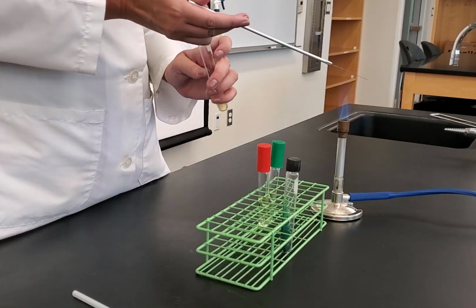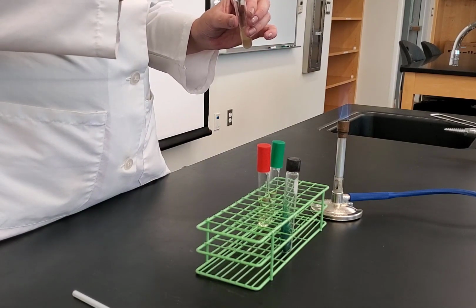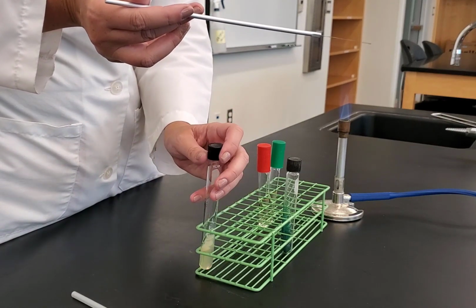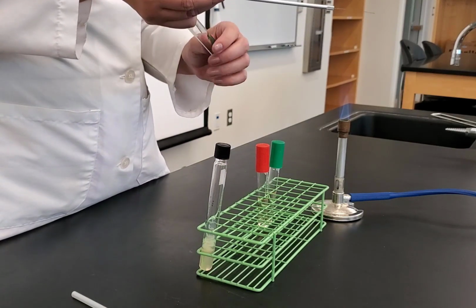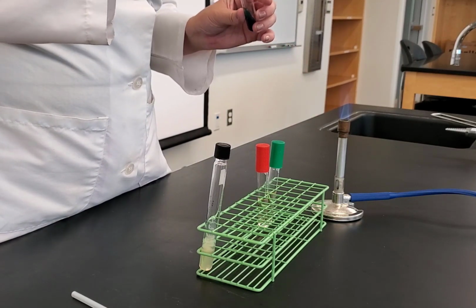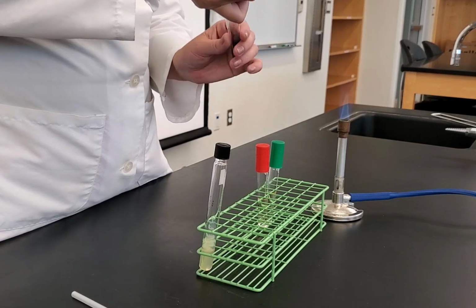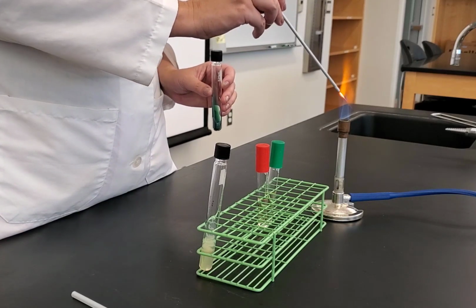So I'm going to take my tube, flame it, go in and pick up some bacteria, flame it, I'm going to take my citrate slant, I'm going to flame it, and I'm going to do my zigzag inoculation using my needle. So starting at the bottom, zigzag and work my way up, flame, cap, and then I need to flame sterilize my needle before I set it down.